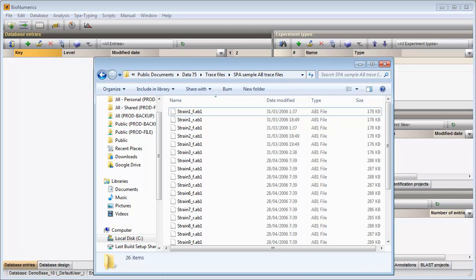In order to import and assemble these trace files in one import round, the trace files should be present in the same folder and file names should contain the sample names.